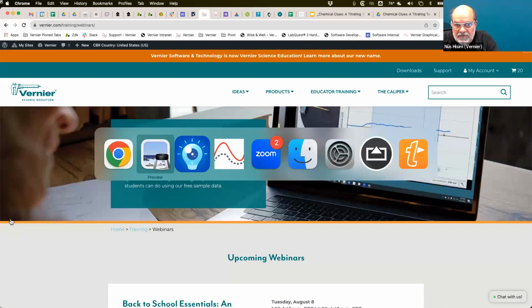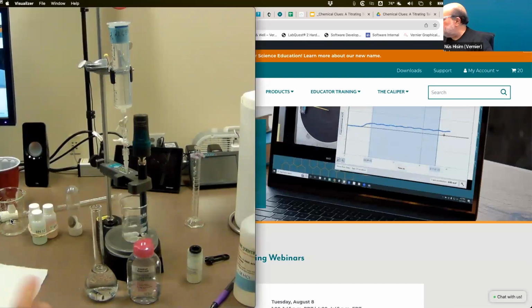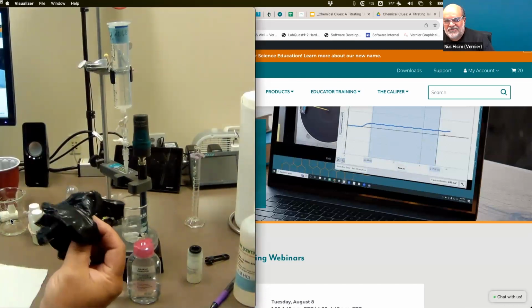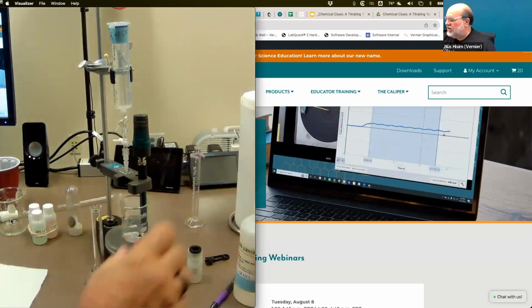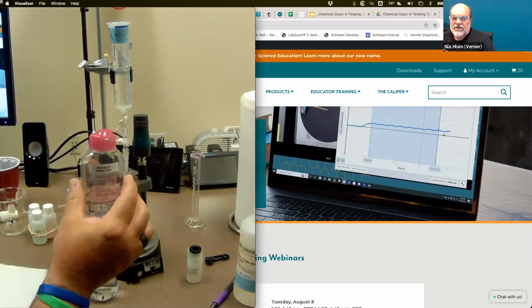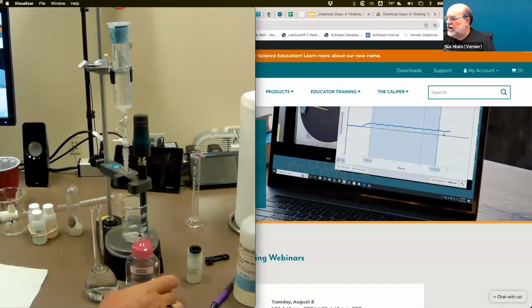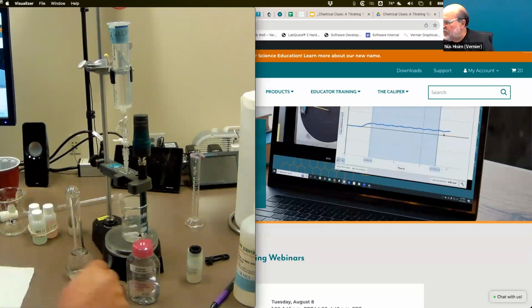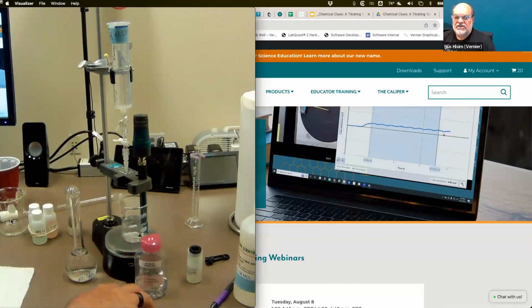Let me get the camera back over here. So one thing you saw is that I was wearing gloves. Part of it is for dramatic effect, but part of it is that it is a 2 molar solution of sodium hydroxide. So that's something to consider. In my classroom, I had a spill kit handy whenever I needed it. The main thing, if you're a Flynn person, is that when you spill low concentration acids and bases, it's just a ton of water. You just need to rinse things with water.